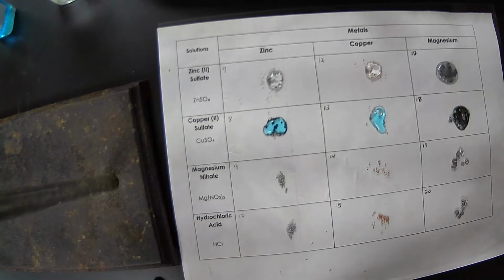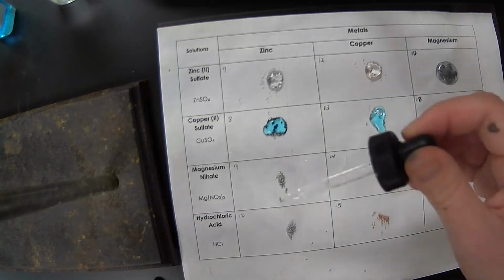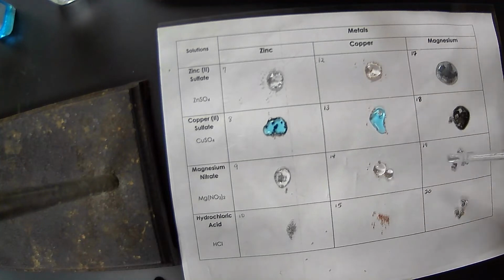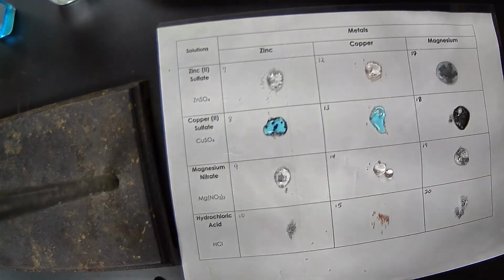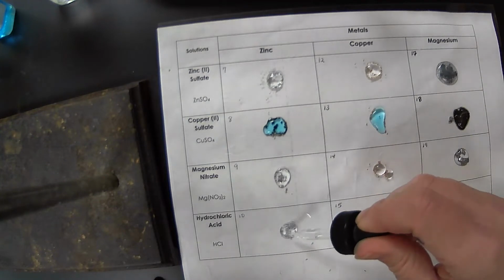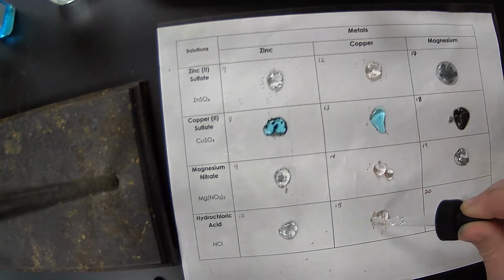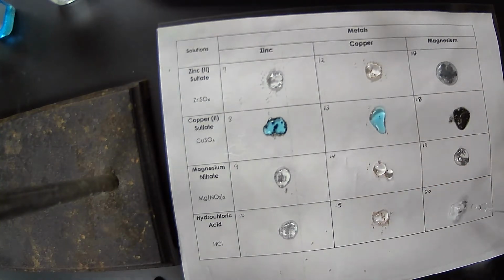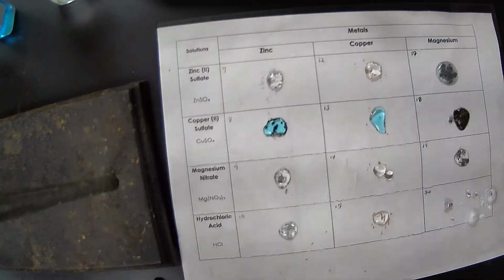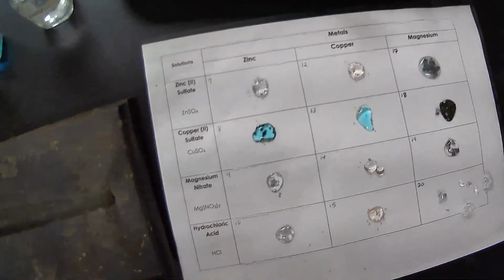All right, and then we have some magnesium nitrate here. Again, 2 or 3 drops in each spot. All right. And then finally, let's do our hydrochloric acid with our zinc. And then the copper. And then with, ooh, there we go, our magnesium. Ooh, you can't smell that, but it's got a little bit of an odor there.